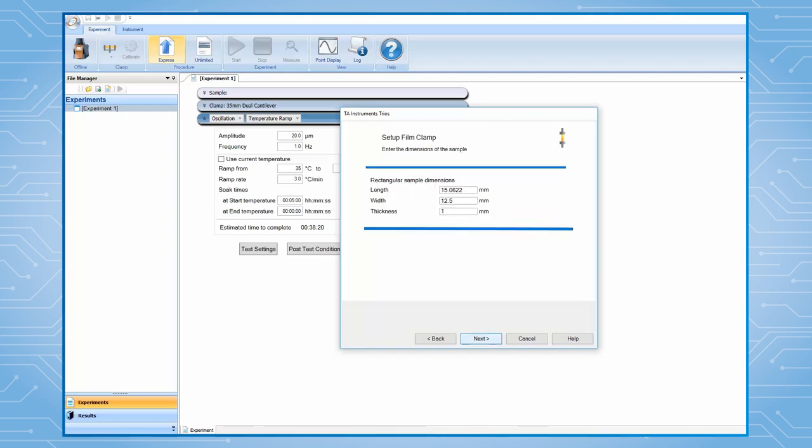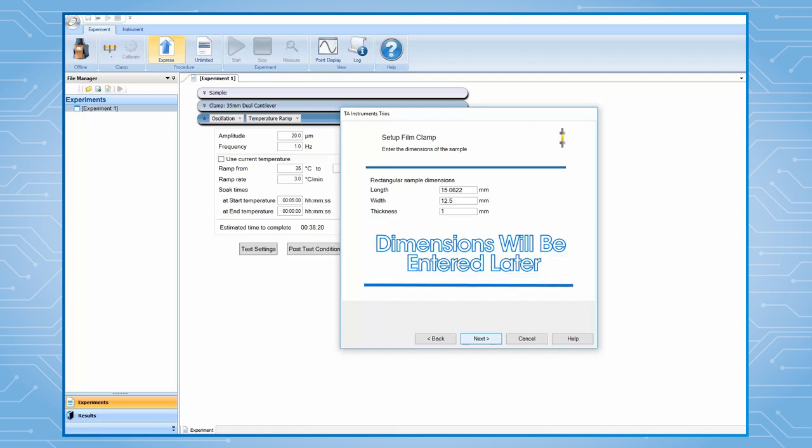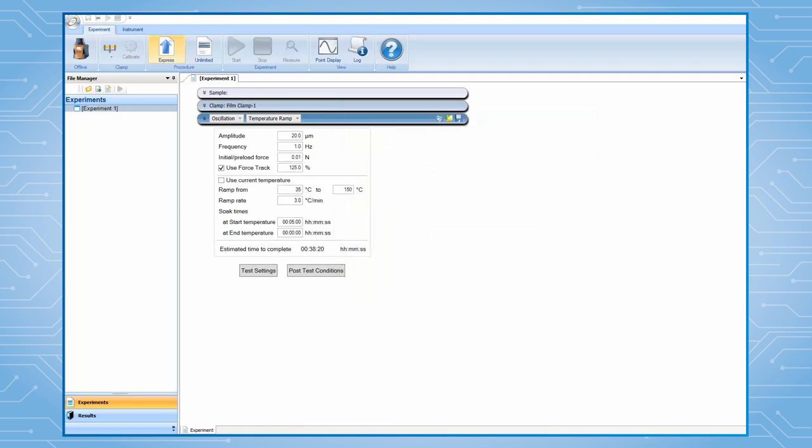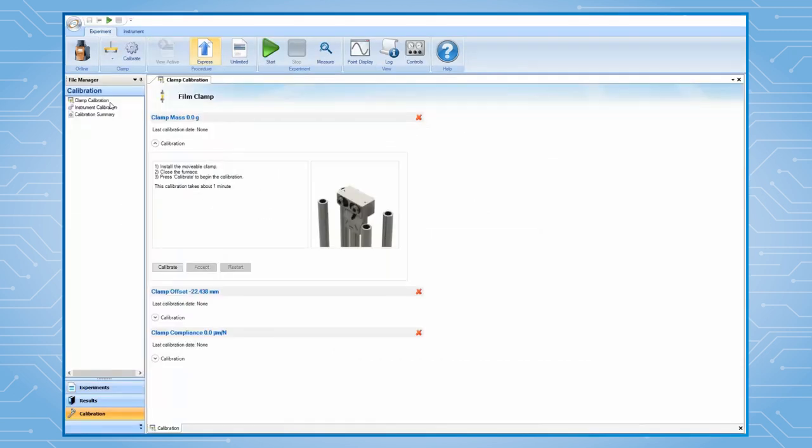Simply click on Next on this page. We do not need to enter a sample dimension at this moment because we will do so later when we program for each individual sample testing. Click on Finish to create this film tension clamp file. Then, TRIOS will automatically lead you to perform the clamp calibration.